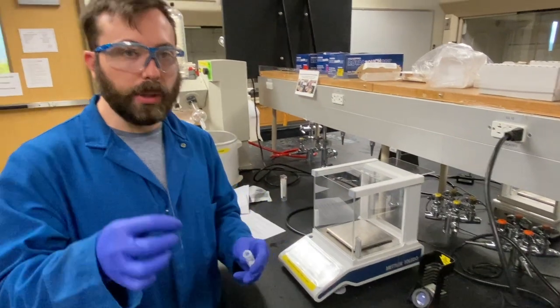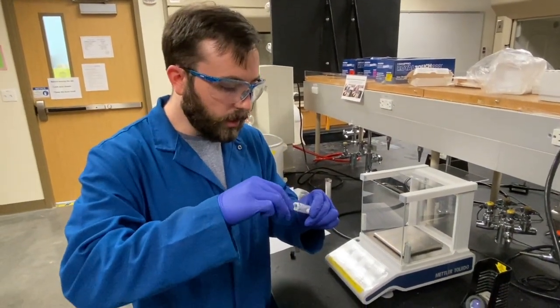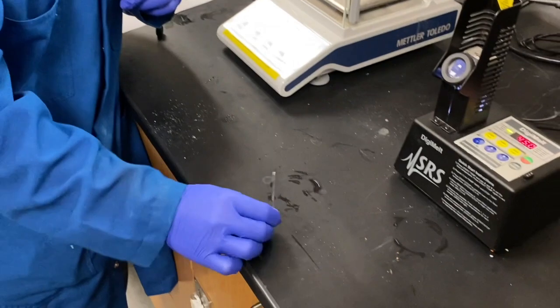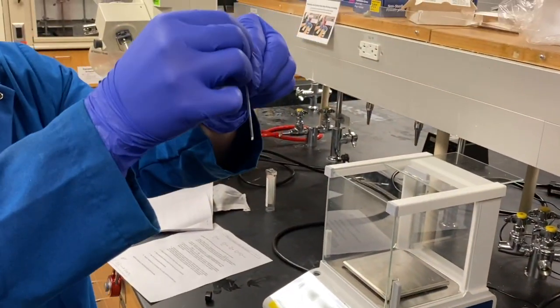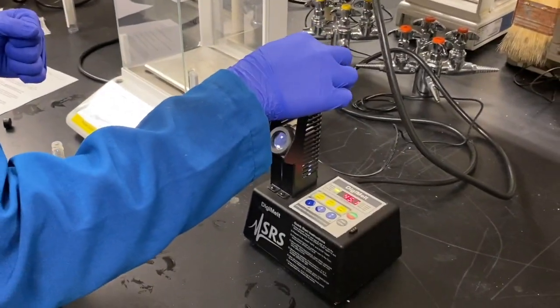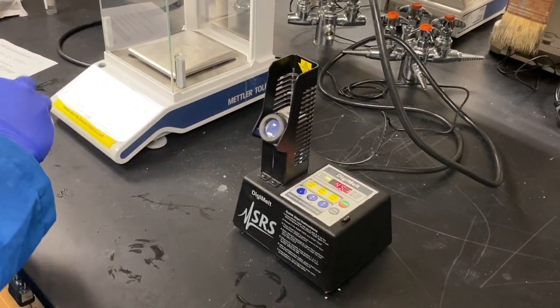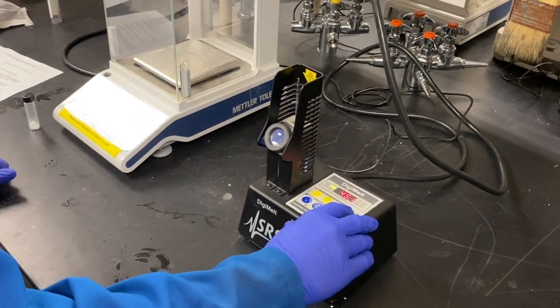Taking a quick melting point with a capillary tube that is sealed on the bottom. Put a small amount of the purified sample in and pack it to the bottom by tapping it. Insert into a preheated digi-melt. The expected melting point for this is about 60 degrees Celsius, so we are starting at 45 degrees Celsius and ramping to 80 with a slow ramp rate.